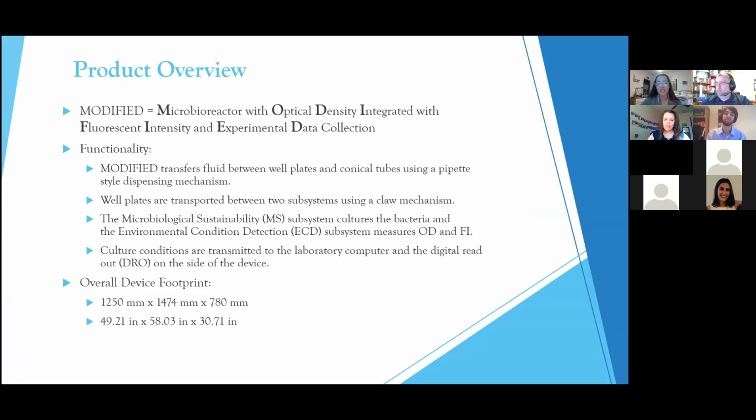As Dr. Traum was saying, yes, modified is an acronym, and it stands for Microbioreactor with Optical Density Integrated with Fluorescent Intensity and Experimental Data Collection. Big mouthful, we know, but we wanted to simplify that, and we made an acronym that we liked and kind of worked backwards from there. So, functionality of our product: modified transfers fluids between well plates and conical tubes using a pipette-style dispensing system, which we will get into later.